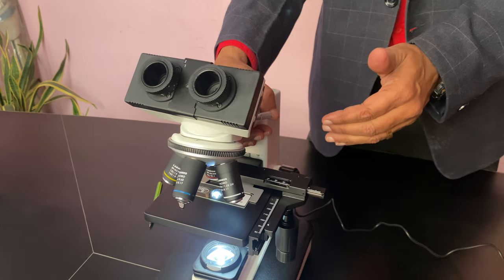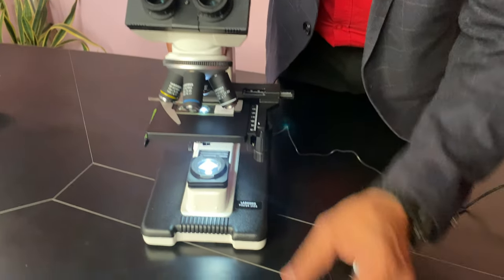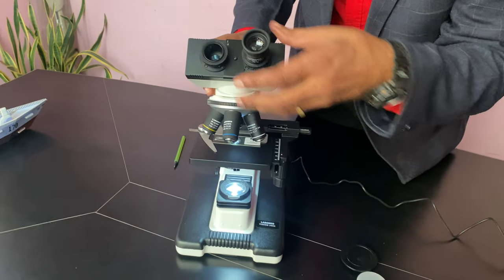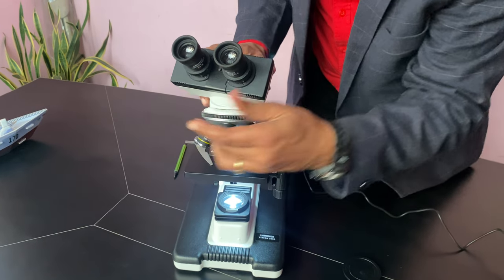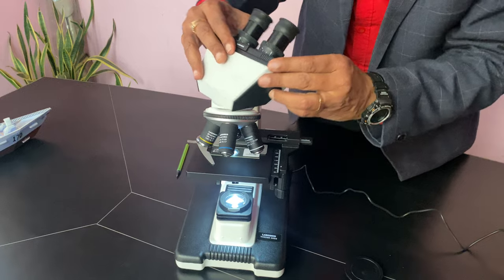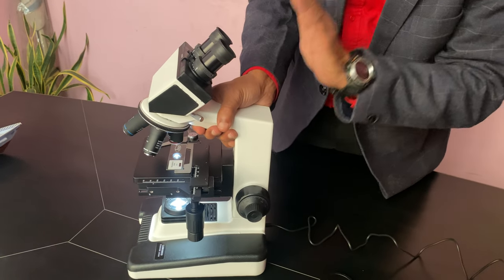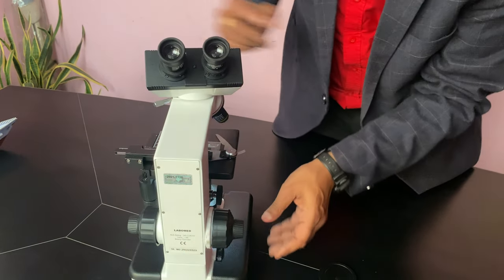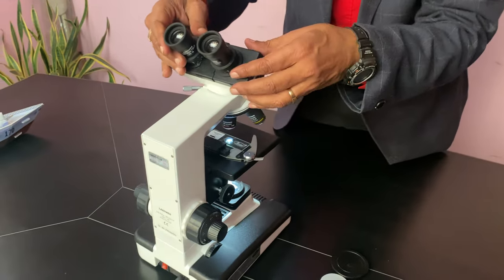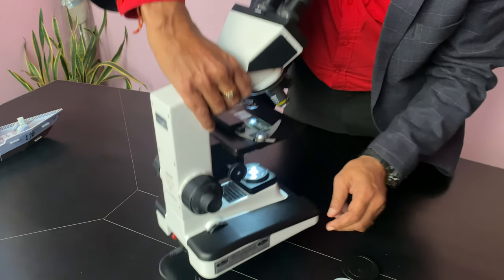Start with 4x, then go to 10x, then 40x, and 100x. Very easy to use. There are two methods to use it — either in the front or on the back side. Some people watch from the front, and some people put the microscope the other way on the stage. You can use it both ways.